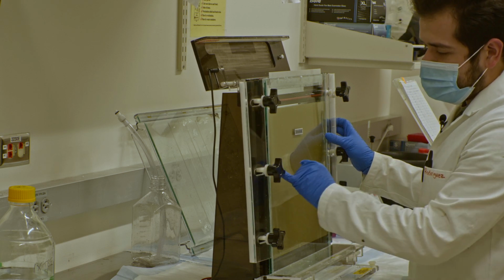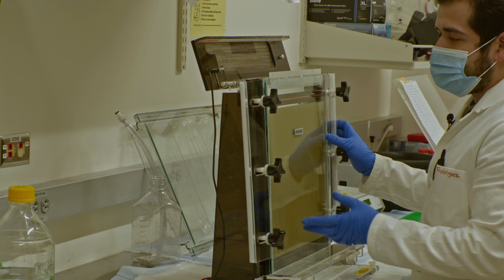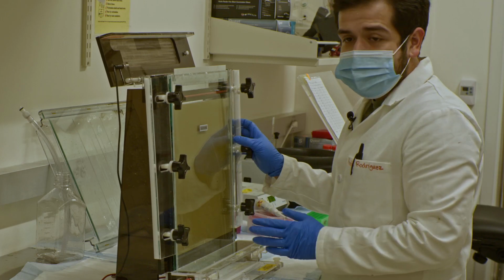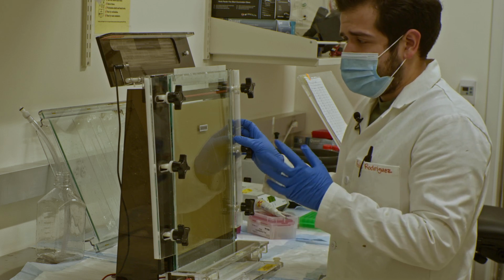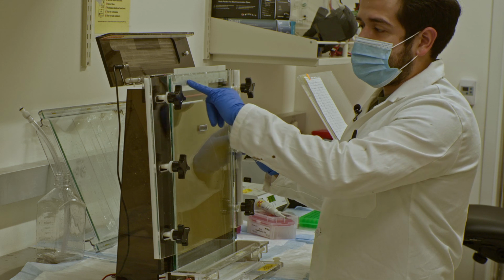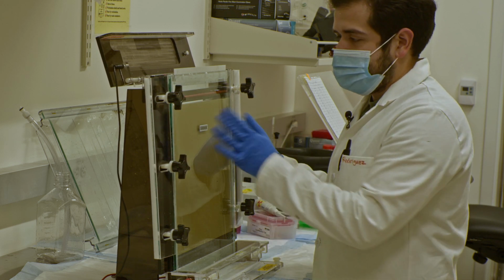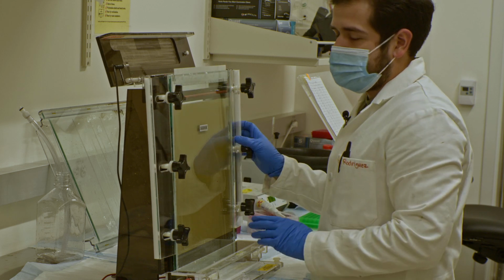You can just do this by using water and then using towels in order to dry it and effectively take off that grime. See, for example, here in this case, we actually have some buildup on the front of the gel. We can take that off by, again, just using a little water and taking off those gel pieces. Now, before I do that though, I'm going to tighten the gel here.